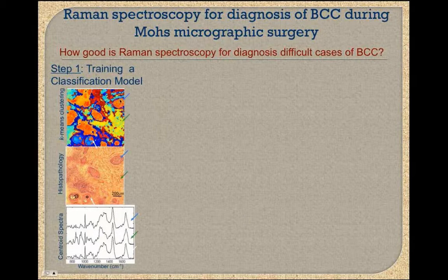So for example, as you can see this region here, that's tumor. So we can label that as being the spectra belonging to tumor regions, and those would look something more like this pattern here, while this cluster here clearly comes from an area of healthy dermis, and has these spectra. So you can see very clear differences. This region here comes from the hair follicles, the epidermis around hair follicles. They're all different. This is just examples.